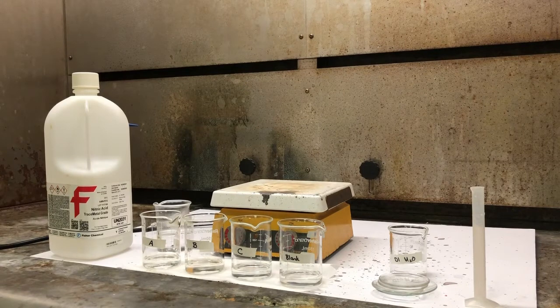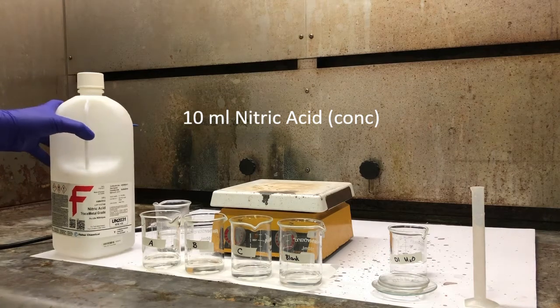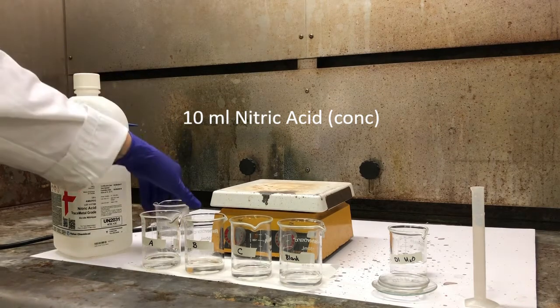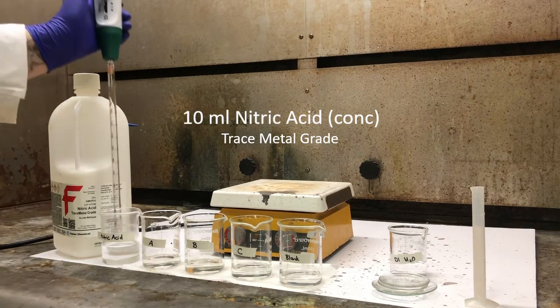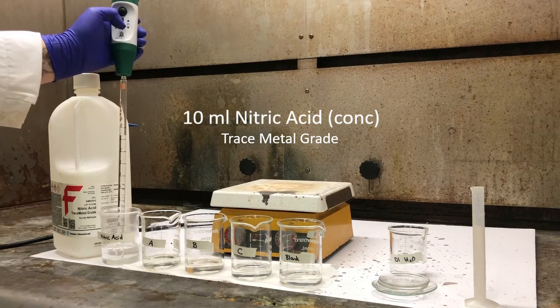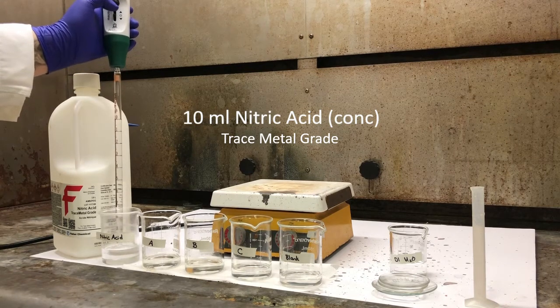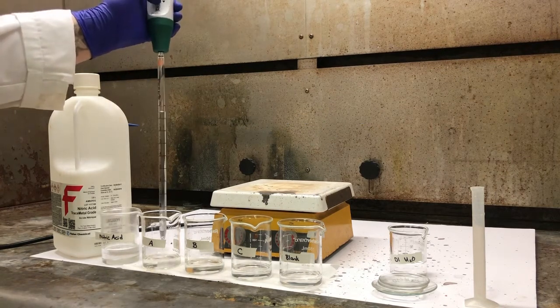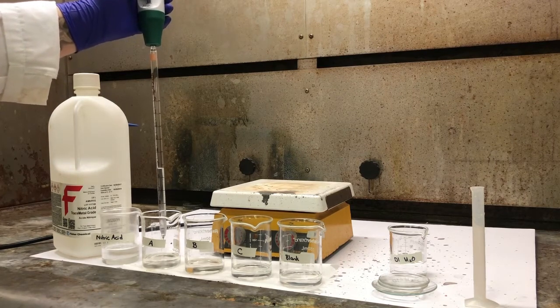After we have the water in, now we're going to add 10 milliliters of nitric acid. This is concentrated nitric acid. It is a trace metal grade, which is useful when we're doing trace metal analysis, such as atomic absorption. I've just poured some out into a beaker for us to use, and I'm going to put 10 mils using a pipette into each beaker. Of course we're doing this in a fume hood because we're dealing with concentrated nitric acid, which is highly corrosive.